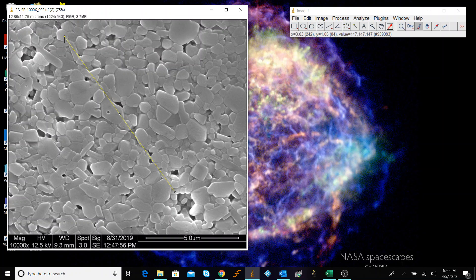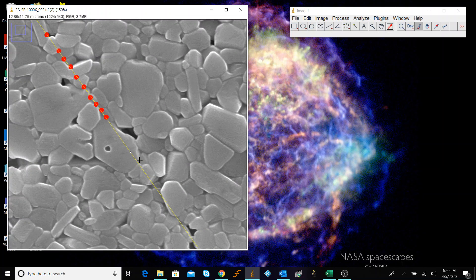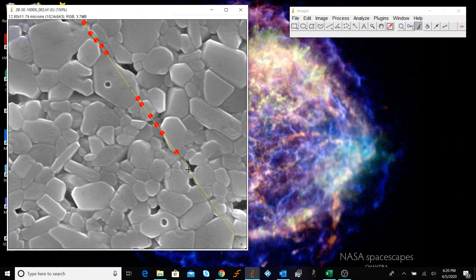Now we zoom in on our line and start counting the intersections. We go along the line marking each one: one, two, three, four, five, six, seven, eight, nine, ten, eleven, twelve, thirteen intersections marked in red. At this point we also have a triple point, so I'll come back to mark that separately.